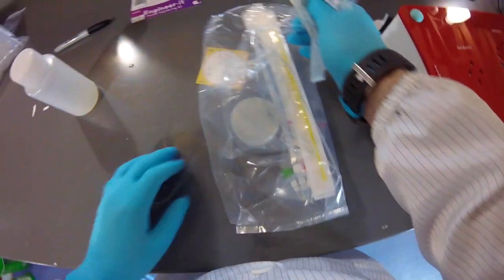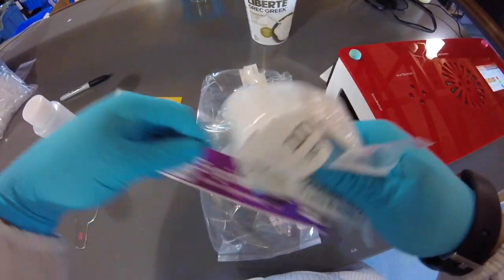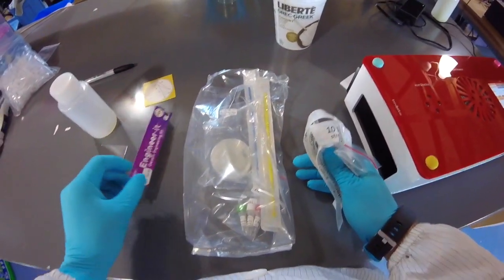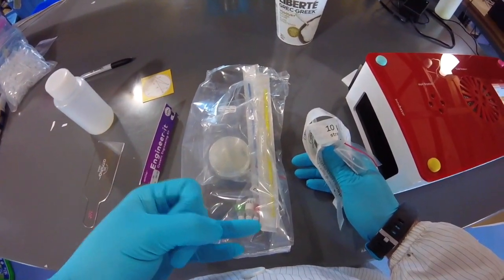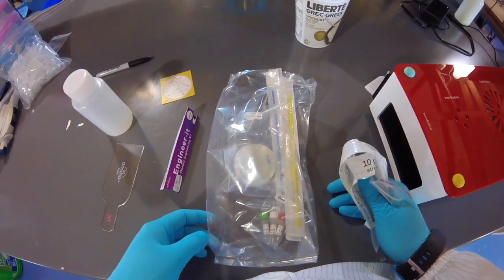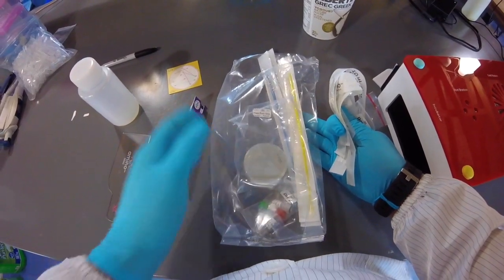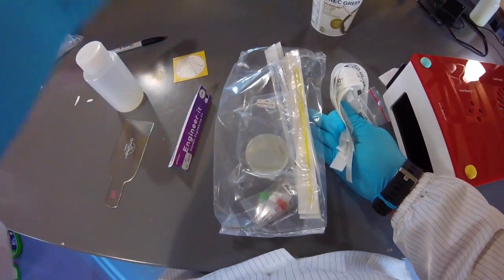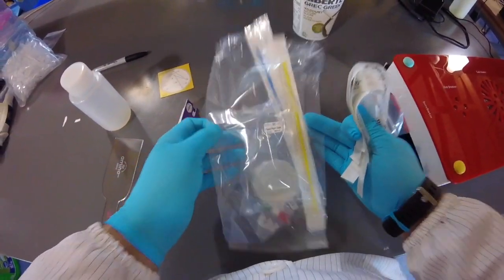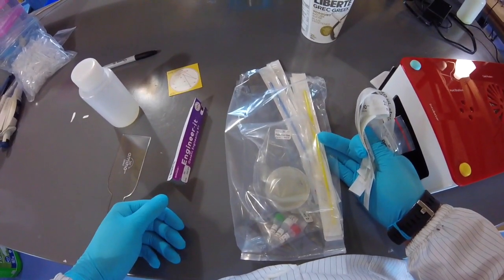Okay. Now, one quick note, comparing this individual engineer kit to the group pack. So the group pack basically comes with some shared resources, which include the DNA, the cells, which we just used, and the inactivation bags. And then there are 8 separate packs that will have the loops and the agar and antibiotics and the Petri dishes and whatnot. So really these 8 different packs can be passed around, and then the different groups just share the cells and the DNA for the most part.